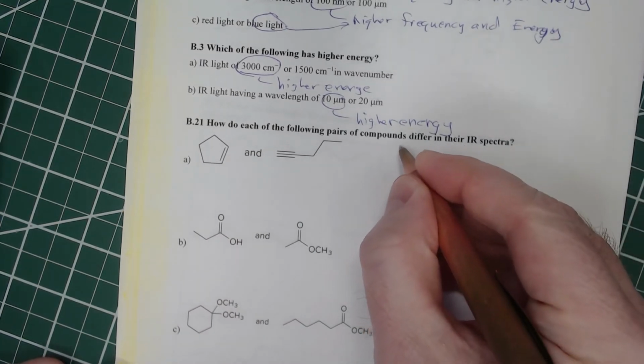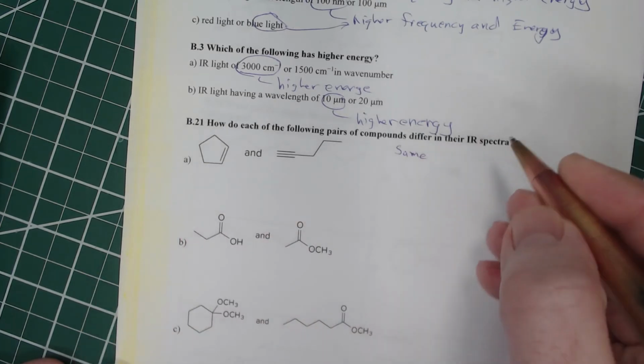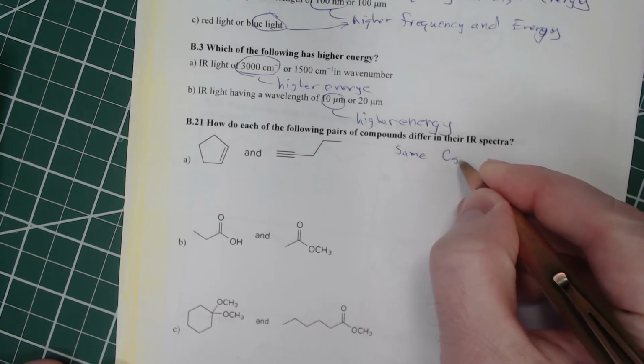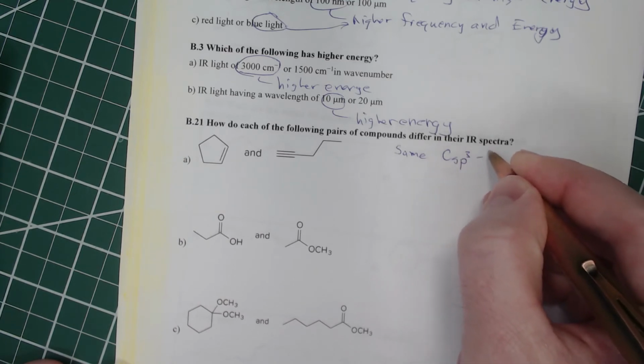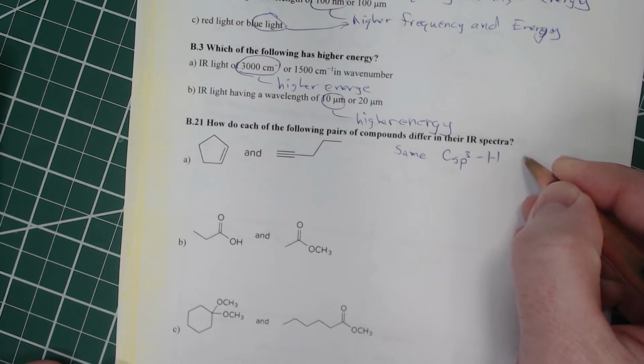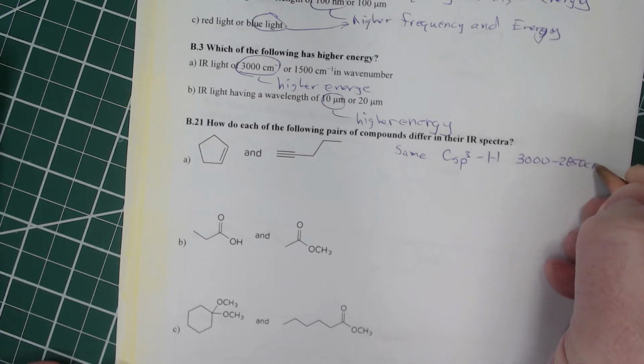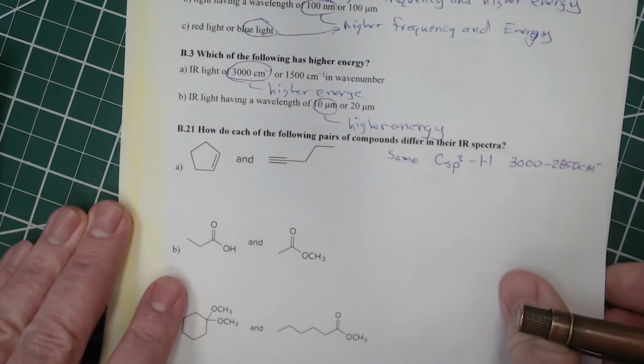So I'll put the same over here. So what do they have in common? Well, both of these have carbon sp3 hydrogen bonds. And so we should expect both of them to have absorptions from 3000 to 2850 reciprocal centimeters.